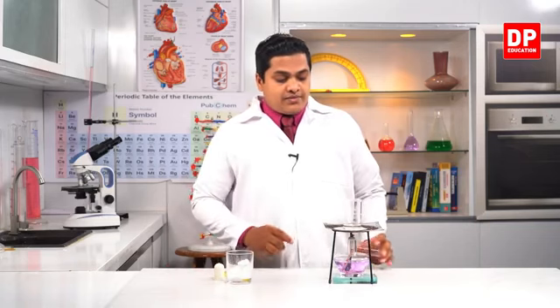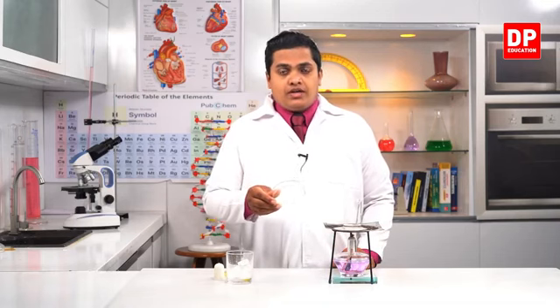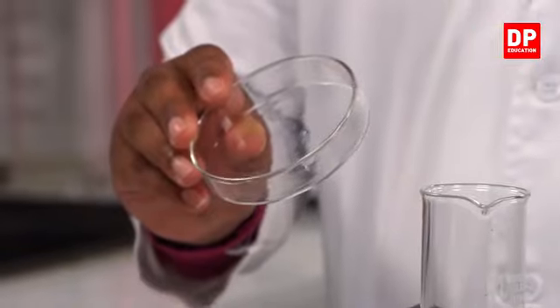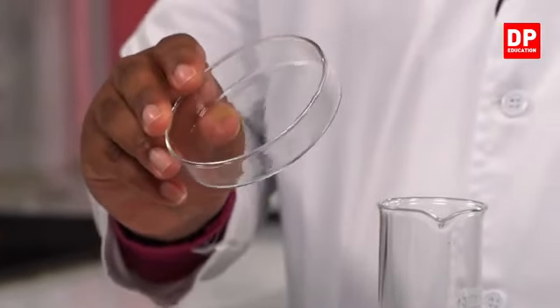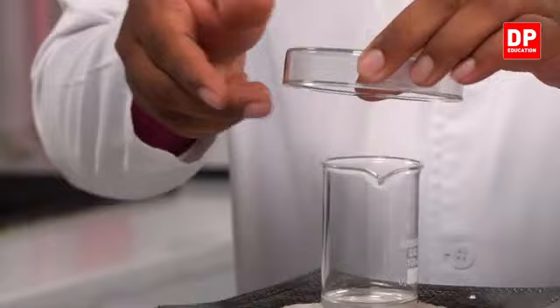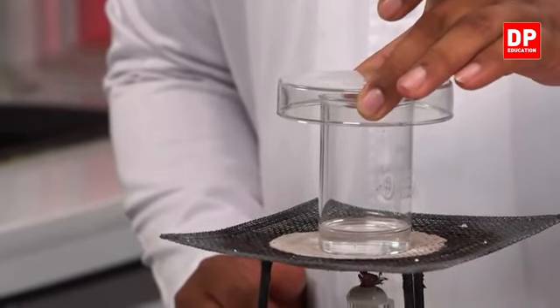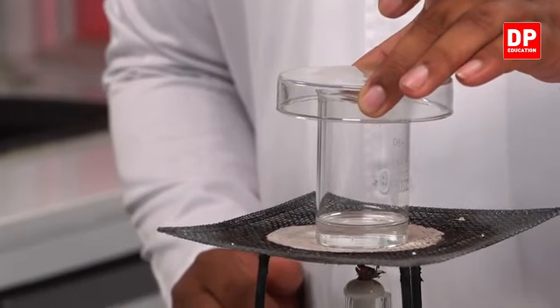Now the system has somewhat heated up. Now I have a petri dish with me, right? See, I have a petri dish with me. Now I'm going to place this petri dish somewhat above the system, the beaker.